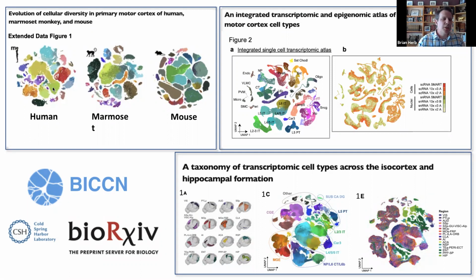This is either a t-SNE or UMAP, depending on the publication. And each one of those dots is going to represent a single cell, and they're grouped together based on their gene expression profile. So as you work with that data set, you'll essentially cluster those cells together and identify the cell types. And from there, you can really understand what are the various genes that drive the phenotype of that cell, and how similar different cell types are.